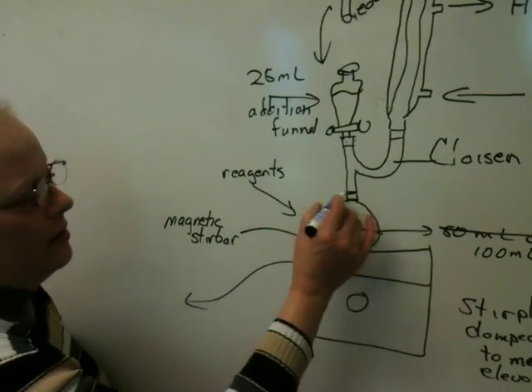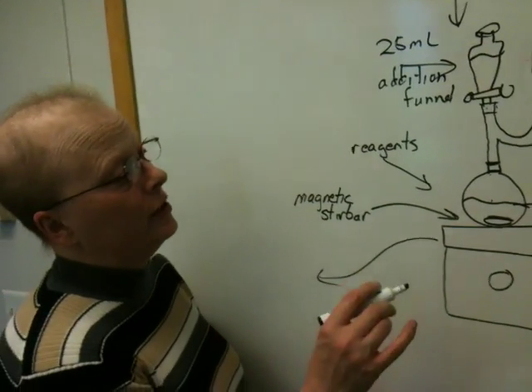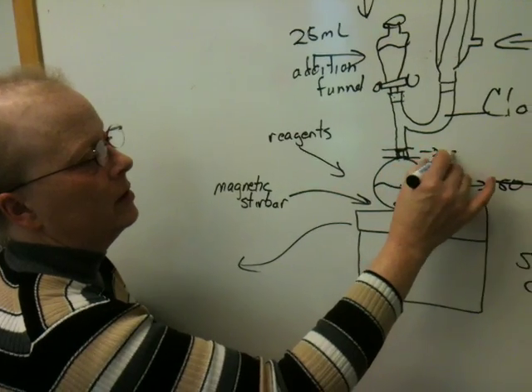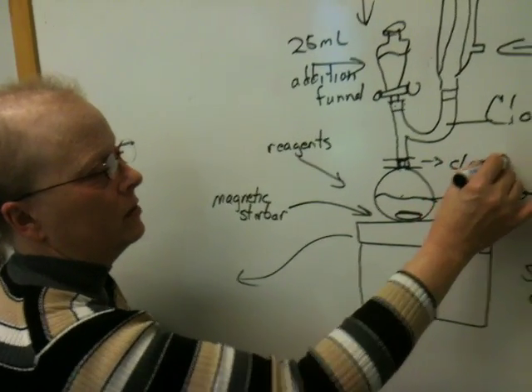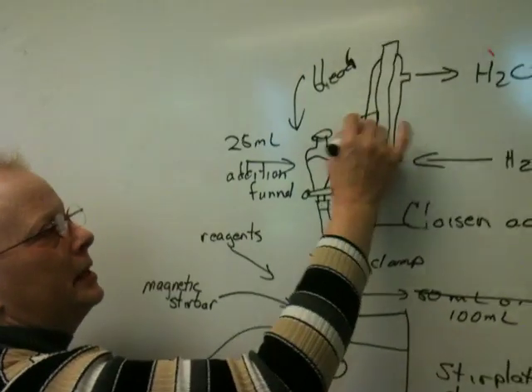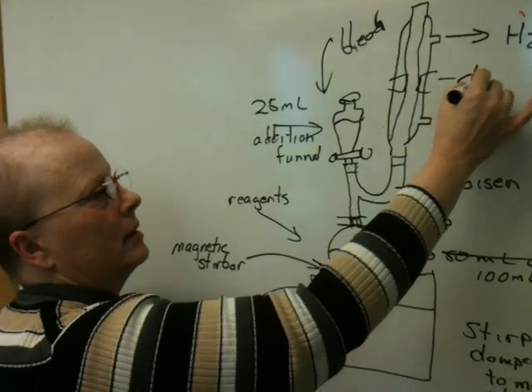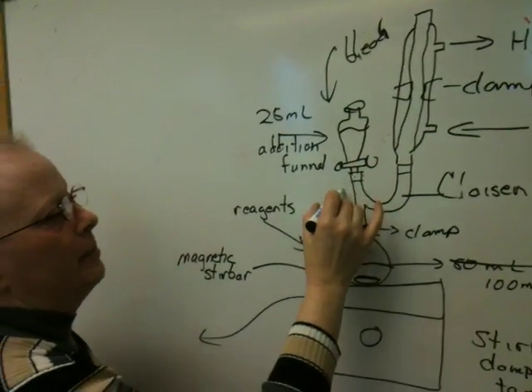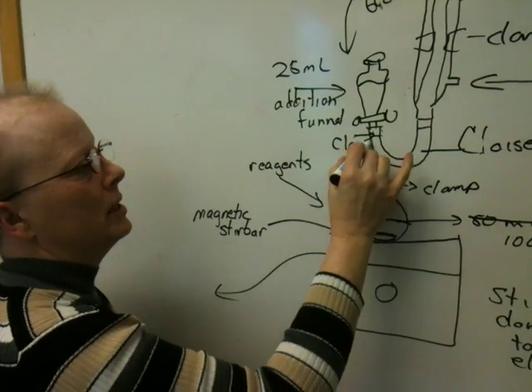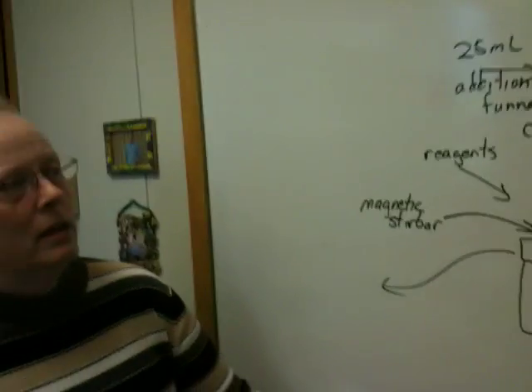Now, as far as clamping goes, always, this week especially, you want to show that you know how to do things. Always put a clamp on the neck of your flask. It's probably a good idea to put a clamp up here. Maybe even a clamp on this piece here. The most clamps I would put on this are maybe three clamps.